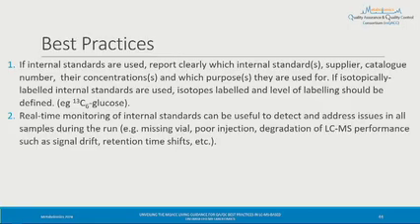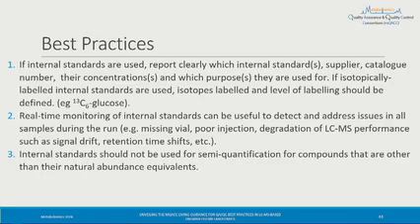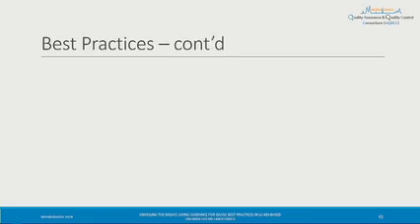Then the next practice is, if possible, this real-time monitoring of internal standards can be very useful to detect problems in analytical batches as they are occurring. So these kinds of things can be anything from a missing vial, poor injection or air in injections, or degradation of LC-MS performance, such as signal drift, retention time drift, and so forth. The next best practice is we don't recommend using internal standards for semi-quantification of compounds unless they are really structurally related coeluting compounds.